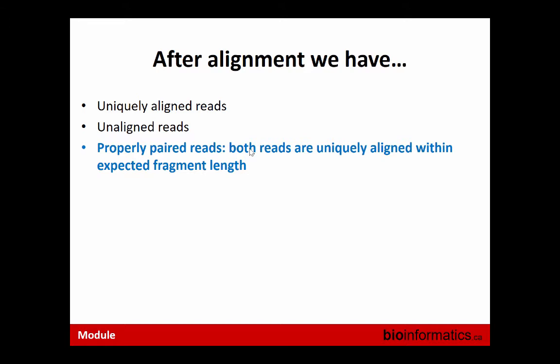It's properly paired reads. And maybe here I'd like to use a few minutes. We already heard from Martin that there are two flavors of experiment. One is single end and one is paired end. And I will be intermingling between the two cases. Of course, when we have paired end, we have more information because we have two reads. They're independently aligned, but they also have a relationship between them.